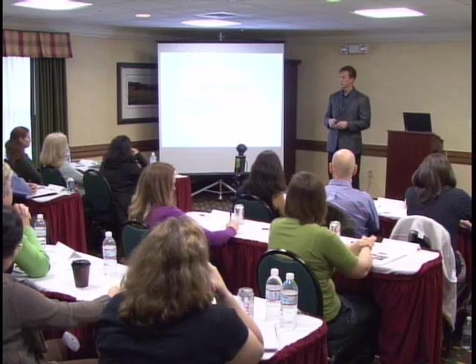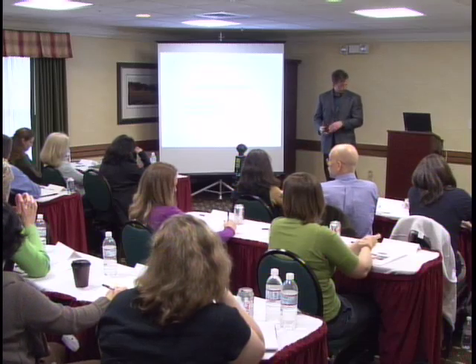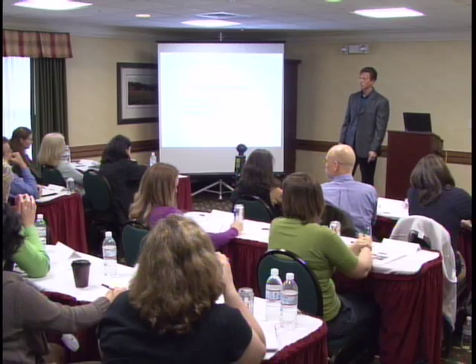Okay, questions? Yes, Les. Do you always find with your repeats with the SNPs in them equal relative intensities and relative abundance between the non-SNP variant and the SNP variants? They're not always perfect, but they're not always perfect anyway. So no, there isn't any noticeable difference between SNPs and none. The reference is arbitrary anyway. You call one the reference and the other one would be a backwards SNP from it. So we haven't noticed any particular degree of variation between the two. No, not really.